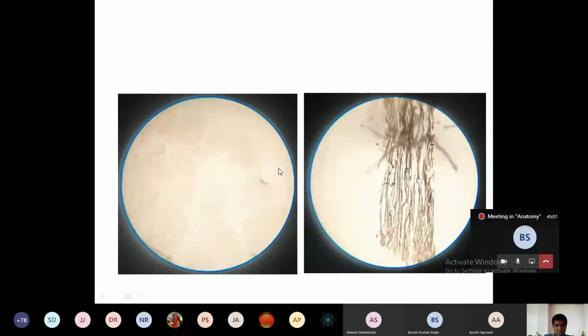Just a minute. Yes. What is this one? This faded section here. Now, whole class, whoever first can tell it without picking it up. What is this one? Can you tell quickly? If you are wasting time, I'll not give you a chance because I have to finish a lot of things.